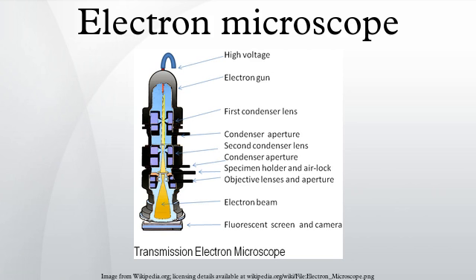Staining uses heavy metals such as lead, uranium or tungsten to scatter imaging electrons and thus give contrast between different structures, since many materials are nearly transparent to electrons. In biology, specimens can be stained en bloc before embedding and also later after sectioning. Typically thin sections are stained for several minutes with an aqueous or alcoholic solution of uranyl acetate followed by aqueous lead citrate.